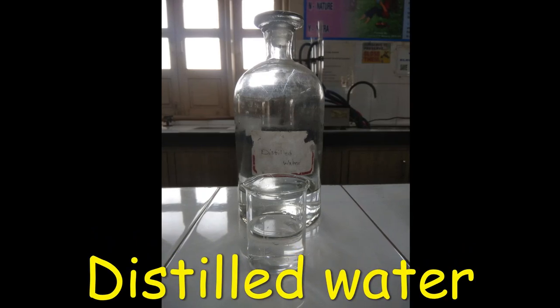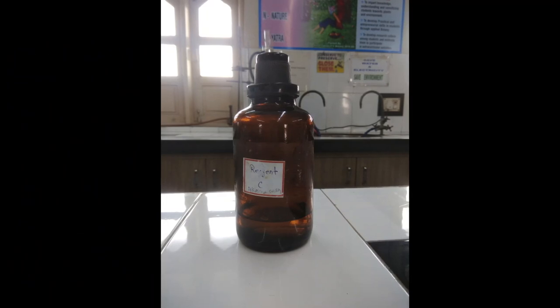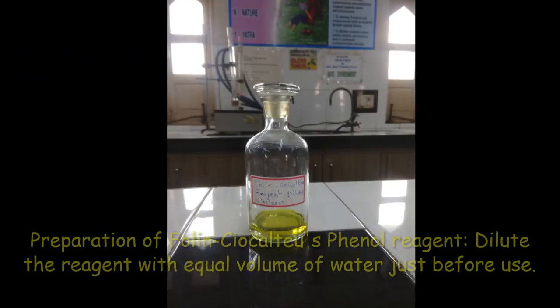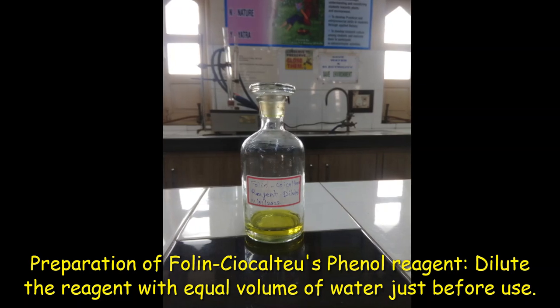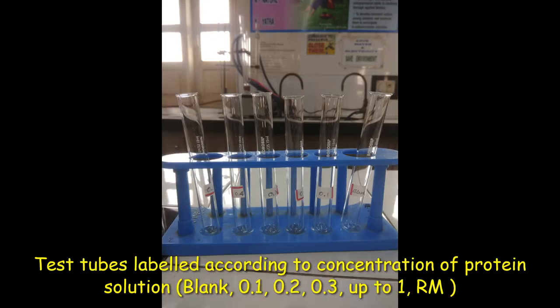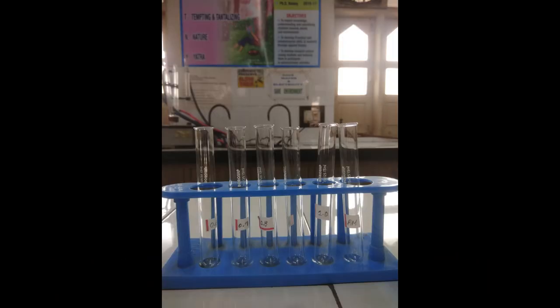Then you need distilled water. Reagent C, which is prepared by mixing reagent A and reagent B just prior to use. To prepare Folin-Ciocalteu phenol reagent, dilute the reagent with equal volume of distilled water just before use. Label 10 test tubes for standard, one for blank, one for reaction mixture.